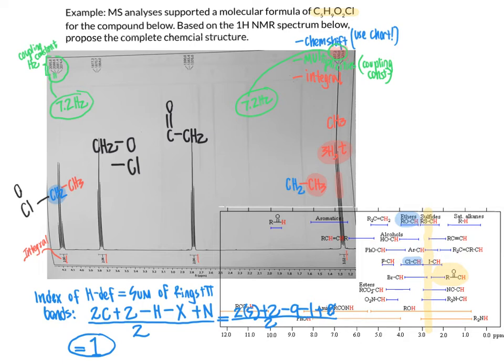So now that we have that piece in place, we want to know, what is this CH2 group coupled to that's causing it to appear as a triplet? Looking at the spectrum, there's really only one possibility that is likely relevant here, and that is that it is directly bonded to this CH2 group at 3.8 ppm. That is in green. So if I plug that green CH2 group that was at 3.8 ppm in here, and I think about what the multiplicity of it was, our triplet at 3.75 ppm.